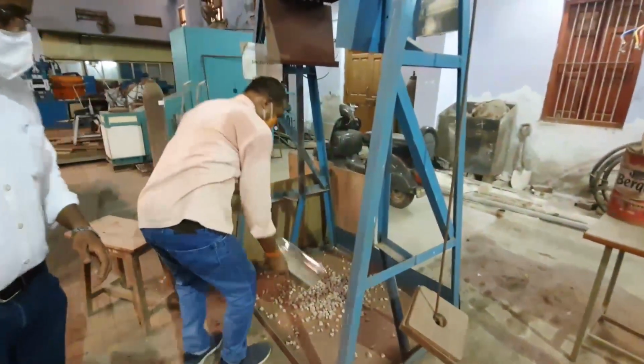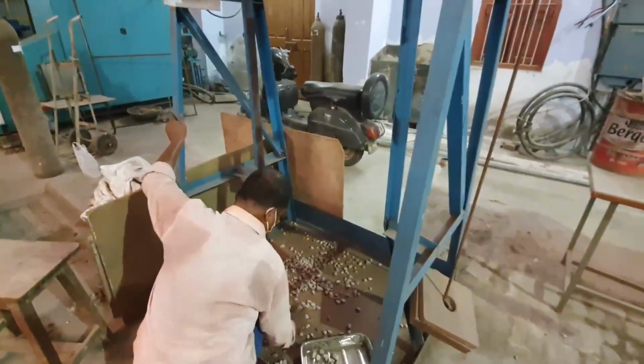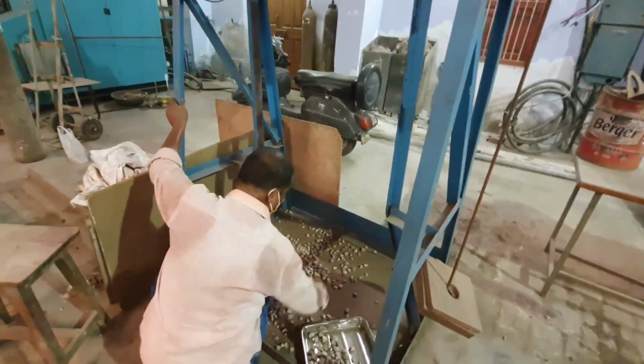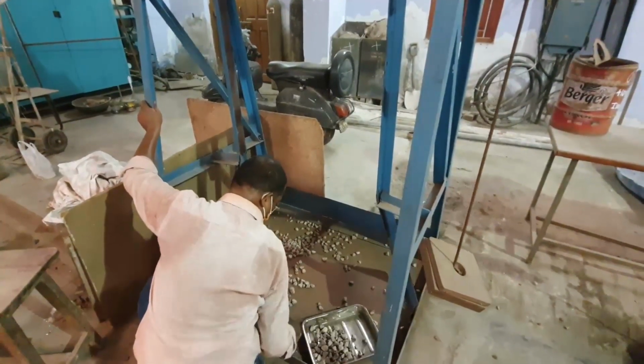Completed this one. So 4 drops are already completed. Now we are collecting the material because we have to weigh this fraction like previously done for iron ore.